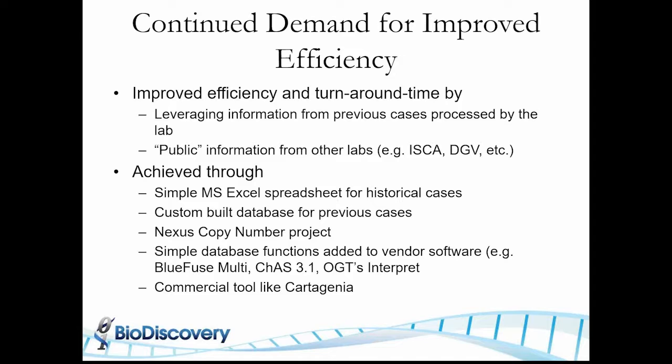of thousands of samples. And other array vendors' software, like BlueFuse Multi, has a basic database. ChAS 3.1, which is getting released, I think, right now, just got added a MySQL database for that, and OGT's Interpret software. But other commercial tools like Cartagenia came out several years back, where it's a multi-user database for storing these previous cases.